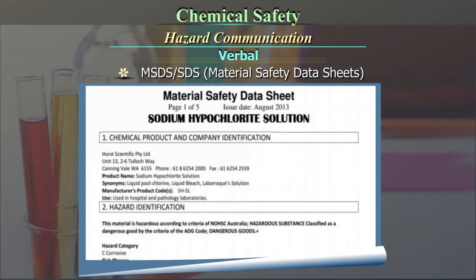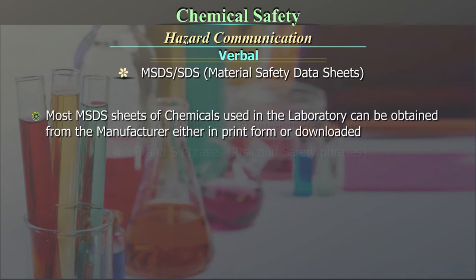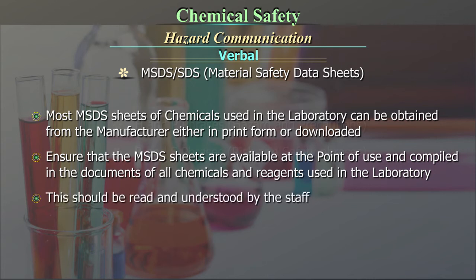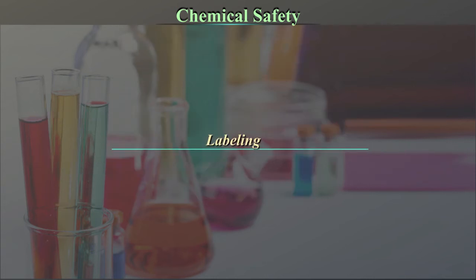Here is an example of page 1 of the MSDS of sodium hypochlorite solution giving all this detailed information. Most MSDS sheets of chemicals used in the laboratory can be obtained from the manufacturer either in print form or downloaded. Ensure that the MSDS sheets are available at the point of use and are compiled in the documents of all chemicals and reagents used in the laboratory. This should be read and understood by the staff.